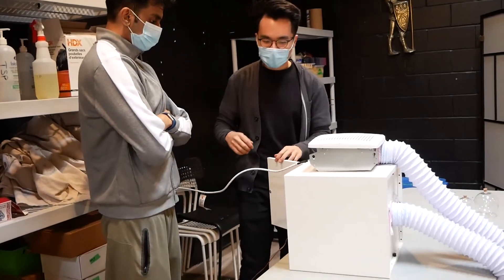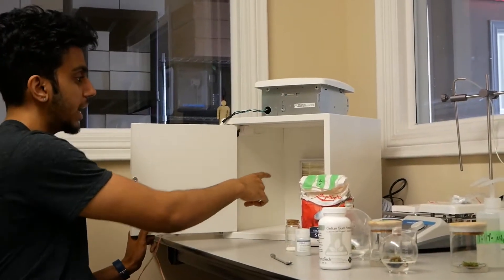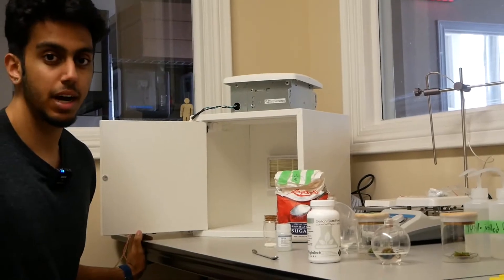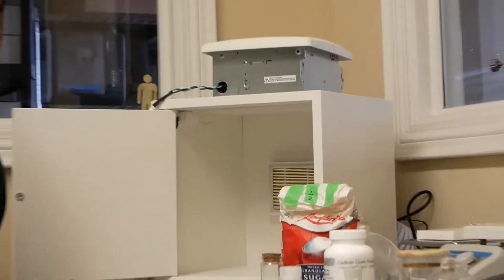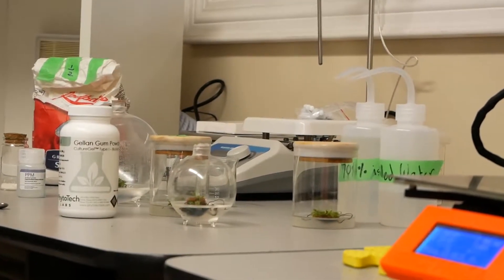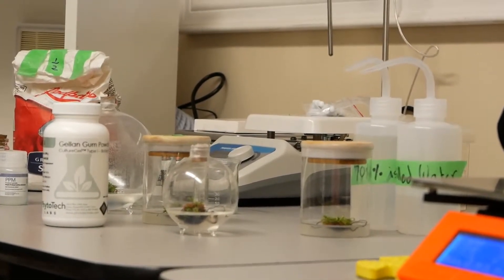The way that this laminar flow hood works is this filter at the back is called a HEPA filter, which actually filters out 99% of all contamination over 0.3 microns in size. We used gloves for this process also and sterilized our hands.